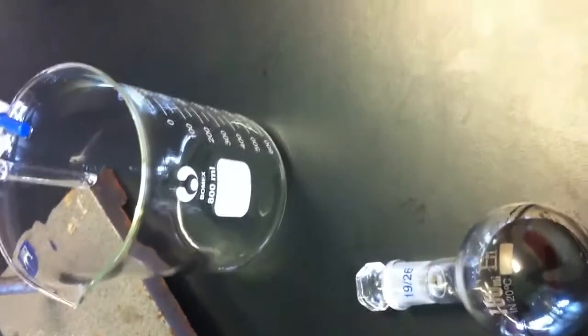There is no lower angle. 100 mil? What do you do with that? Do we pour it into this? Quickly, pour it in. You need to pour it in. Stop looking, come on! Do we pour it into that? Yeah. Okay, then do it. So you're pouring in 100 ml into the... Be careful. Twist it a bit. Boom! Oh, we already have water. That's okay, we'll need it later.